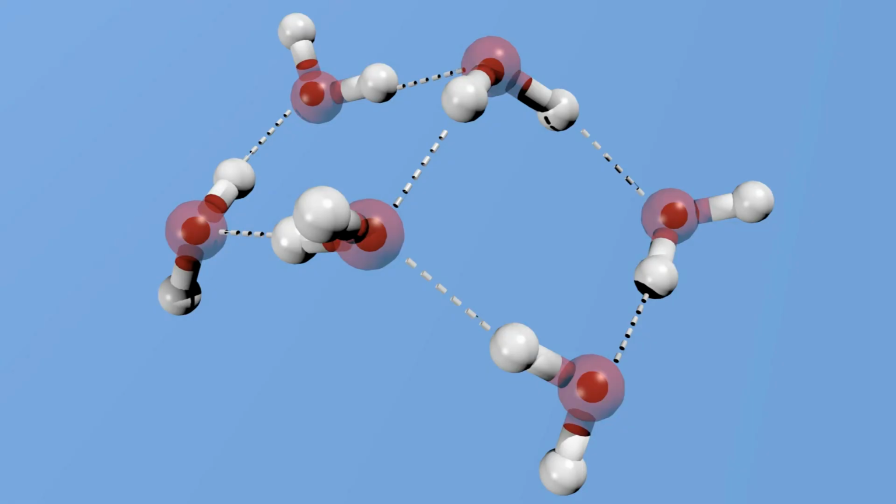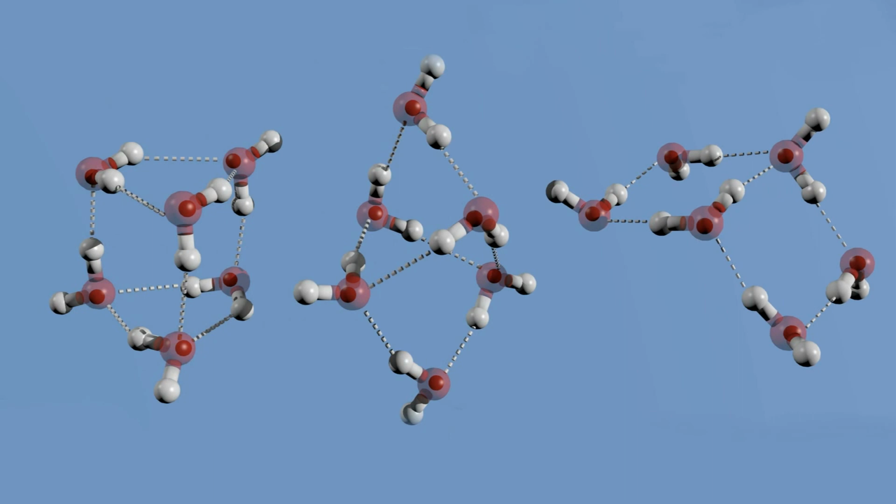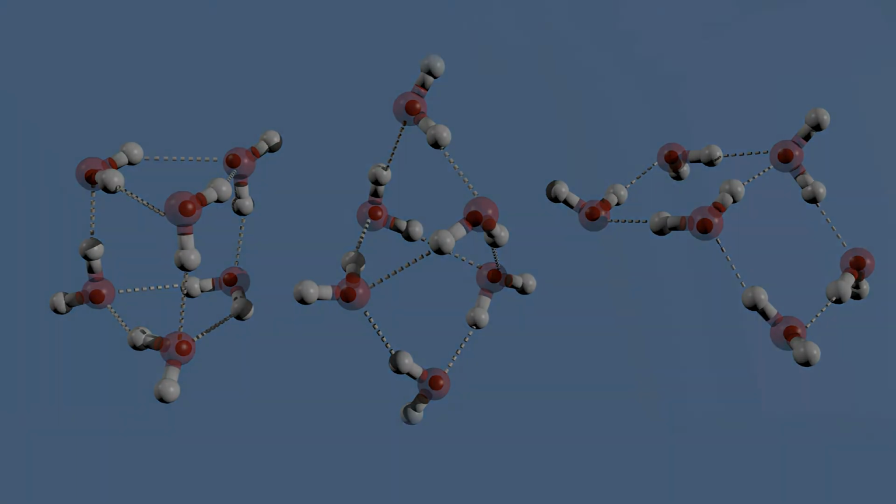Chirp pulse rotational spectroscopy has the advantage of being able to measure 6 different isotopes and their parent in a single experiment. Additionally, the incredible resolution of the technique can detect all 3 isomers of hexamer, book, cage, and prism, and their isotopes in one experiment as well.